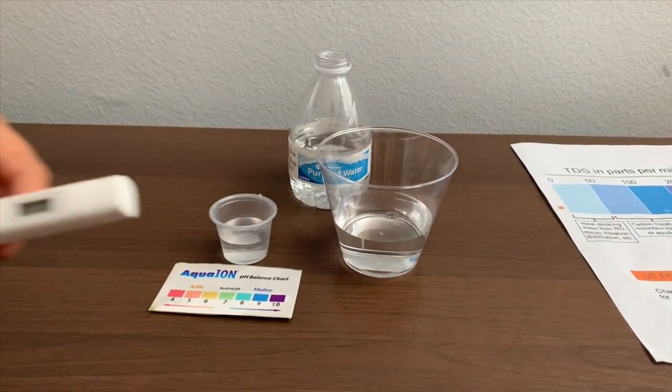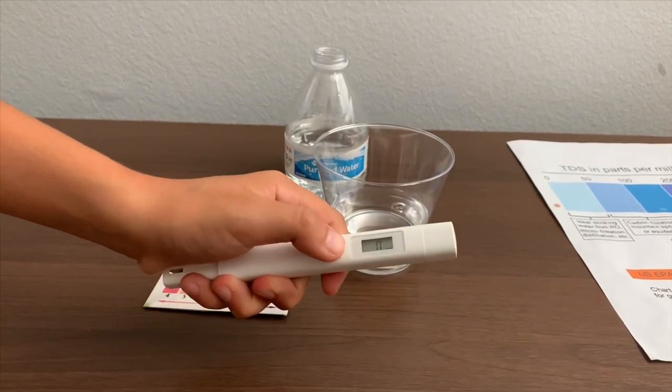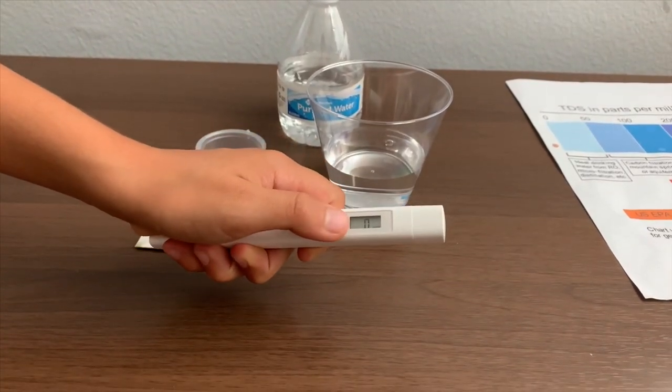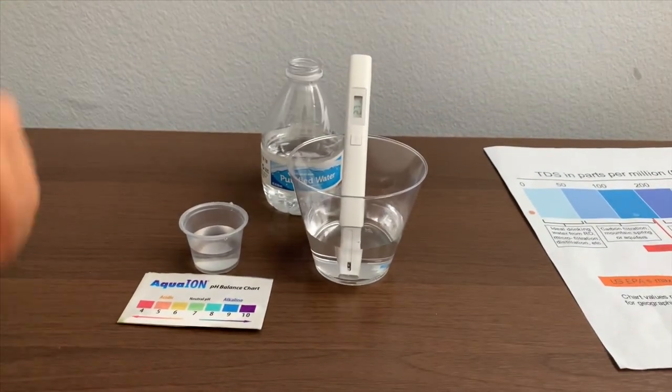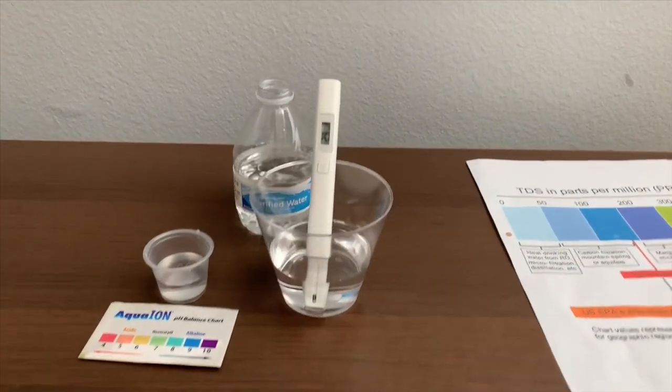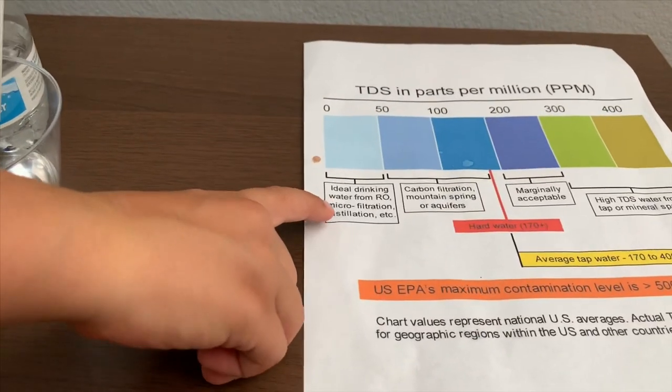If you want to buy this TDS tester, check the link down below. Turn on the TDS tester, make sure it says zero, and put it in. Twenty-nine. That is microfiltered water.